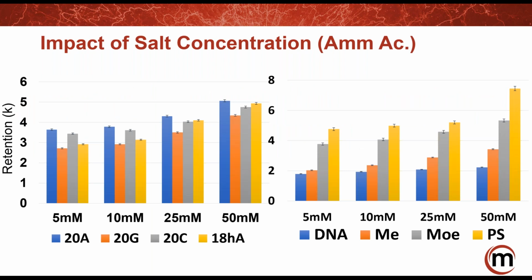So when I looked at this, again, it's a compromise, right? Chromatography, if you increase one factor, you might decrease another factor. 50 millimolar, our intent is to move this to MS, the separation, because that's really what is the foothold in oligonucleotides where most of these separations are done is LCMS, but also for reaction monitoring, LCUV is very important.